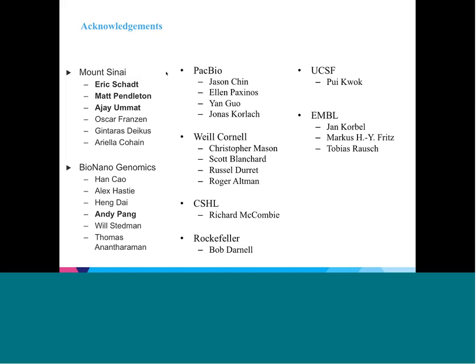The next question is, how do you determine if a structural variant is homozygous or heterozygous? Bobby was just saying that the way we do that is through pile-up analysis. For the short reads on the PacBio side, we cluster together the reads on each side, and we say, okay, here's a particular structural variant that we predict. And then, are there reads that do not agree with that? So it's basically just aligning those reads back to the particular structural variant.